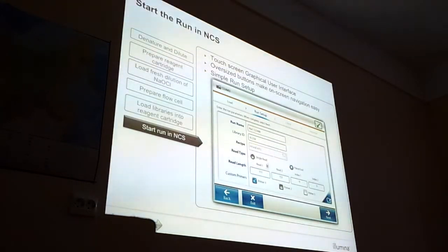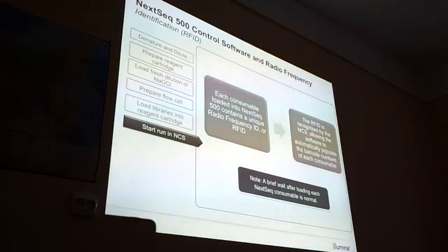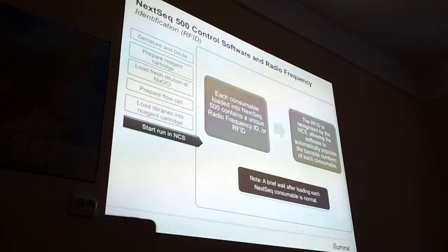Okay, so here you choose the setup. And it's pretty... So when it checks, I'm sorry, can you go back one slide? So when it checks for the instrument disk space and network disk space, it's actually checking if the network disk also has enough memory? Okay. Yes. But I would also check it manually before you do it. This is the same as what we had before.